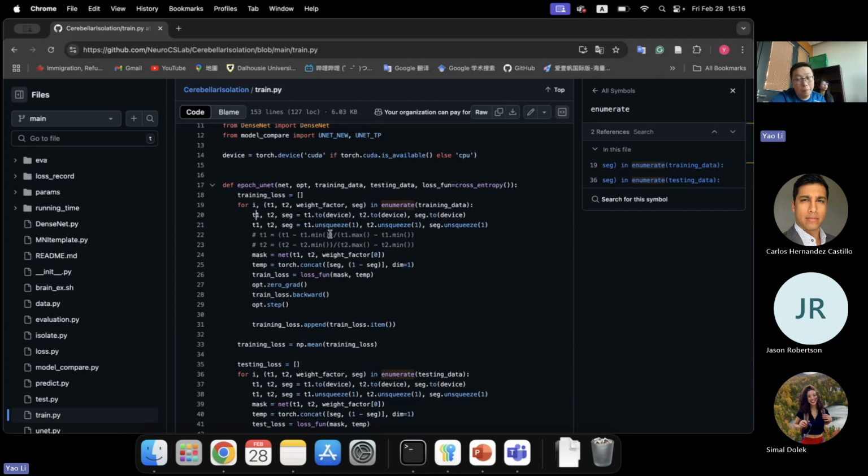And another thing that is important: sometimes it will give you an error, sometimes it won't, and it will just give you results you don't want. It's the dimension. For our 3D images, the model actually takes a 5D array, where the first dimension stands for batch, the second one is channel, and the last three dimensions are our images.